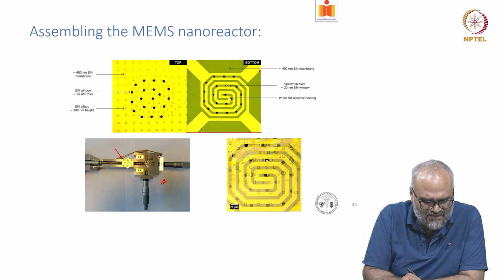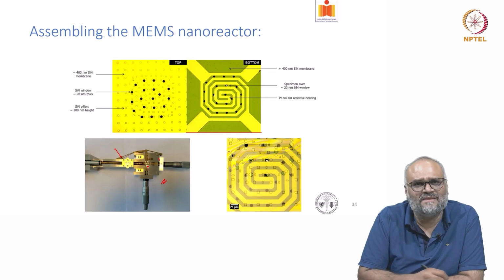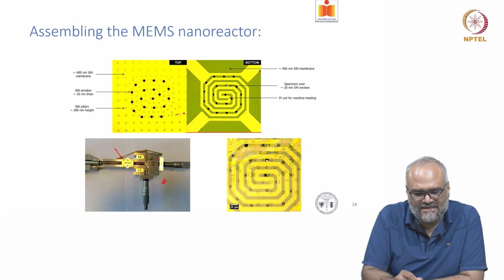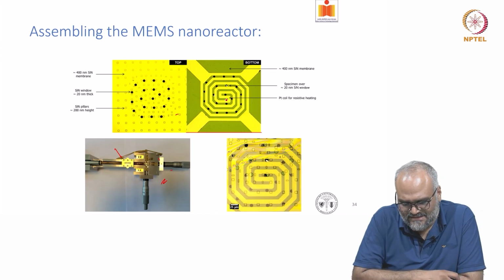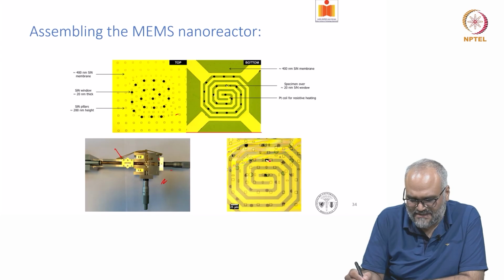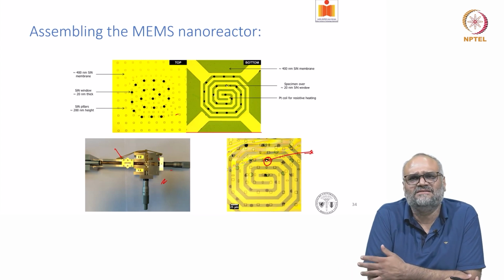So in this kind of a metal block, you had the bottom and top chip together, and with these micrometer screws, you were positioning the top chip on the bottom chip and moving it in the XY plane in such a way that you let the top and bottom chips coincide with each other. And when these two coincide, the region here is actually an electron transparent region.